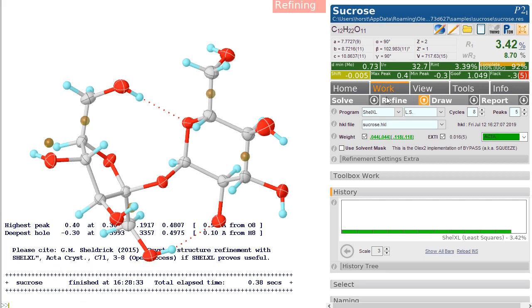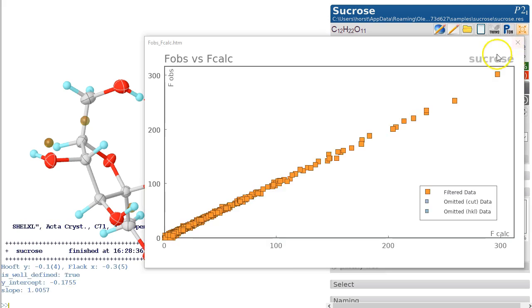The graph should now also be slightly more straight, though it's hard to see.